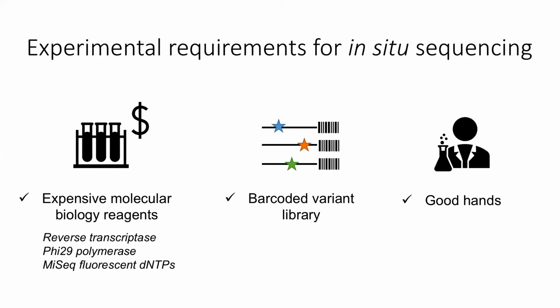I just put that up there because there are a lot of steps. There are a lot of washing steps. There are a lot of reagent addition steps. And because the reagents are so expensive, you really don't want to mess up too many steps or you're going to end up costing yourself more and more money. So those are kind of the things to keep in mind there.